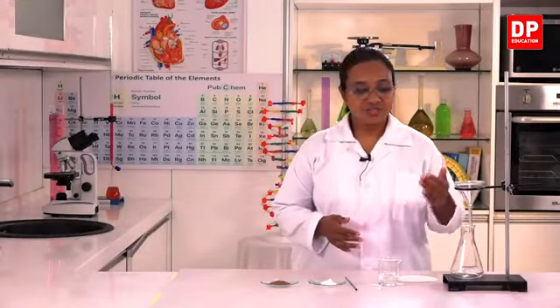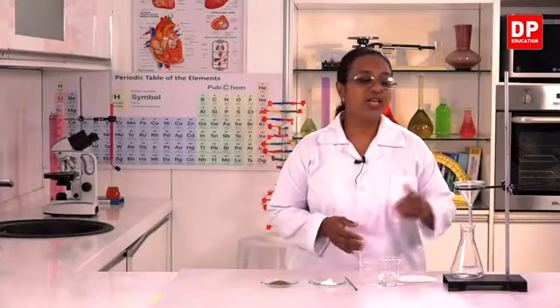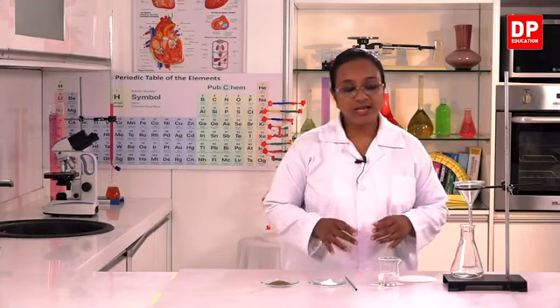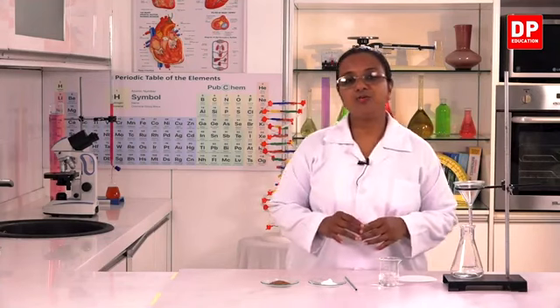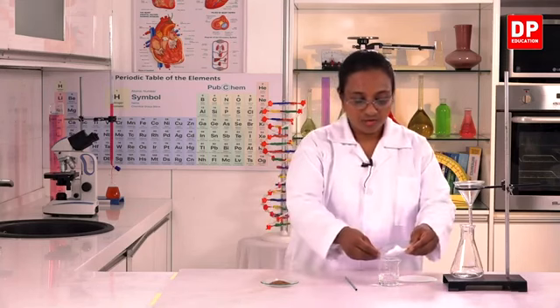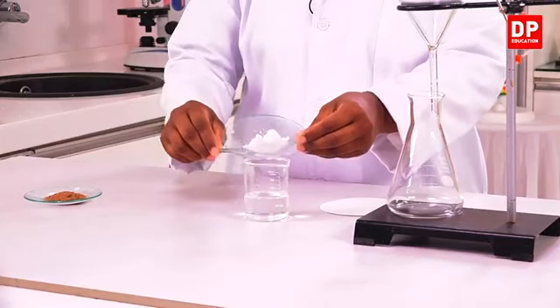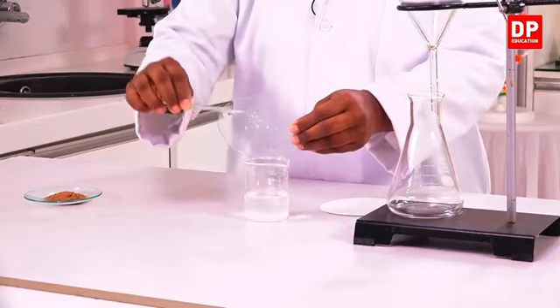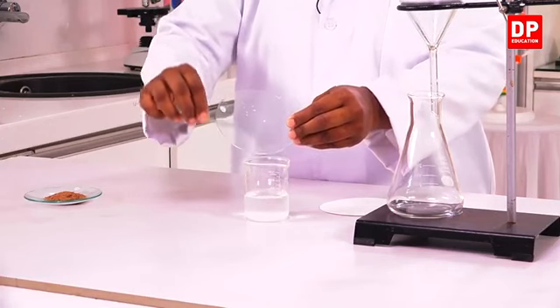Okay students, so now I am going to demonstrate how we do the filtration process. To do that, I have 50 cubic centimeters of water here, and into that I am going to dissolve 5 grams of sodium chloride, and here I am going to show you all the technique.